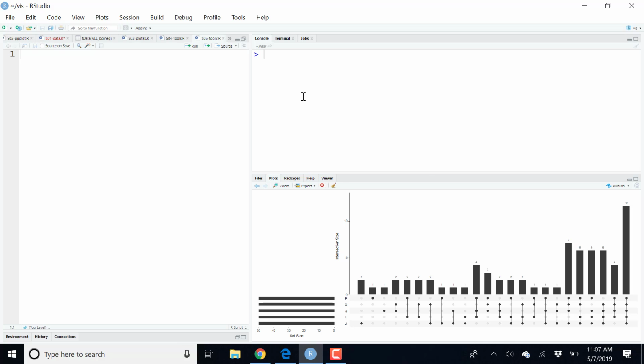And we have an axis here that gives us the height of the tree, and the length of these branches here is proportional to the distance that we calculated. And so we can do this in R using a set of functions. The first one is the dist function that will calculate the distance, and then we can feed the result of this distance into the hclust function to do our hierarchical clustering.